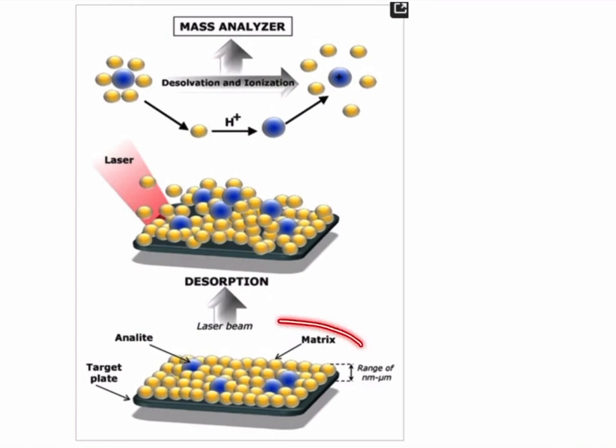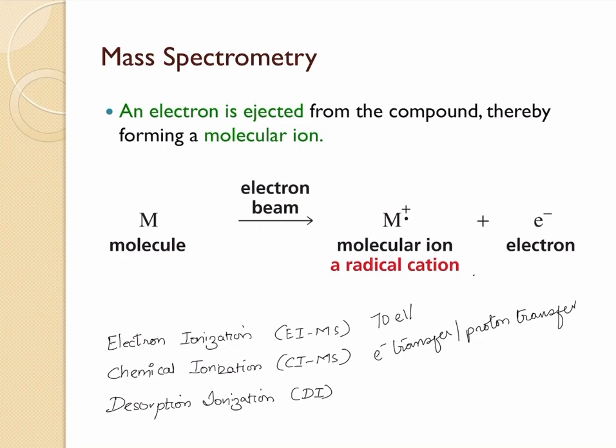In this technique, the sample is first dissolved in a matrix compound, and then it is ionized by one of the several ionization methods that we have. The matrix compound transfers energy to the sample, causing some of the sample molecules to ionize and then eject from the matrix. The ejected ions are then analyzed. The ionization used for bombarding the matrix compound can be done in different ways.